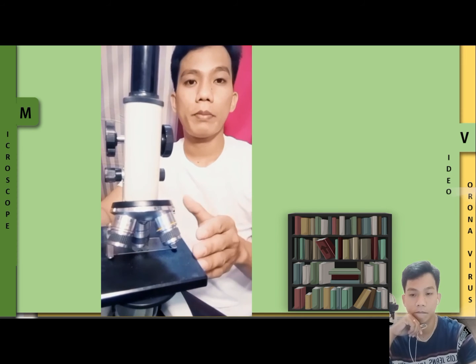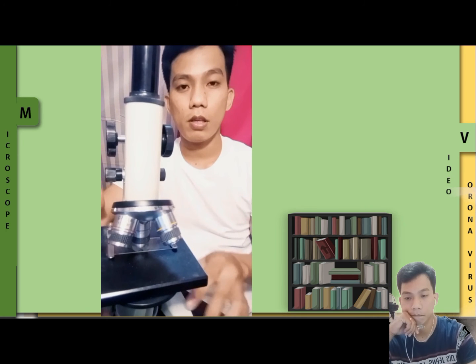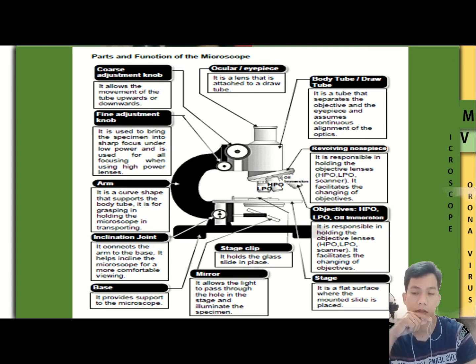Okay? So, babalikan natin i-review dito yung mga parts sa PowerPoint presentation. Okay, so these are the different parts and functions of the microscope. You can see it in the module kung ano yung mga hindi pa nasabi doon sa video kanina.